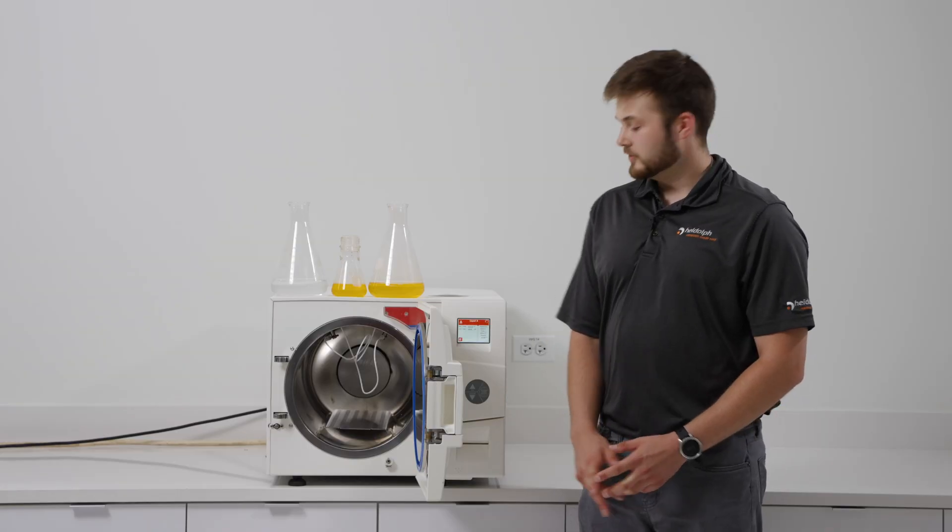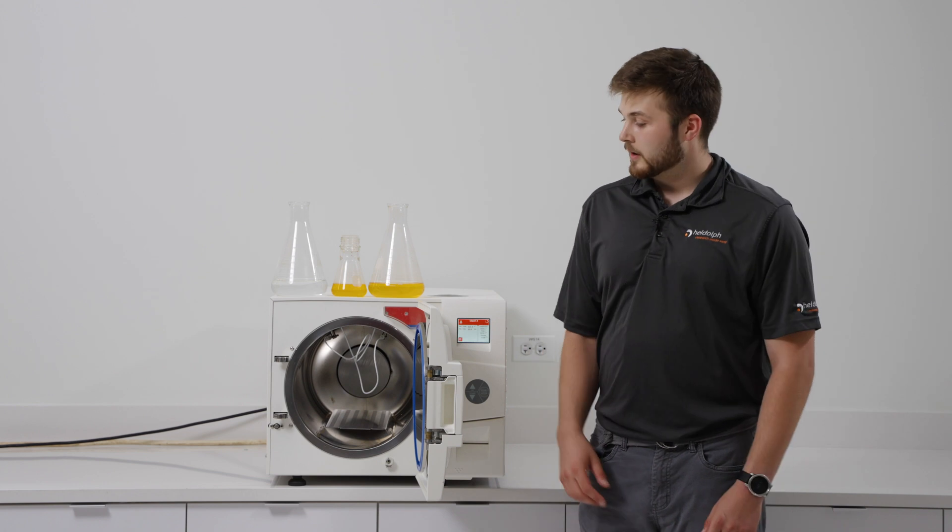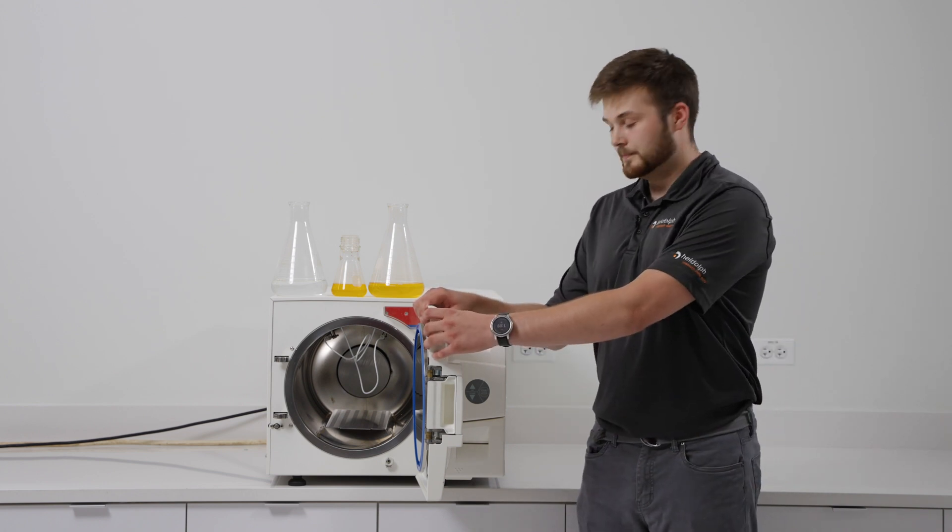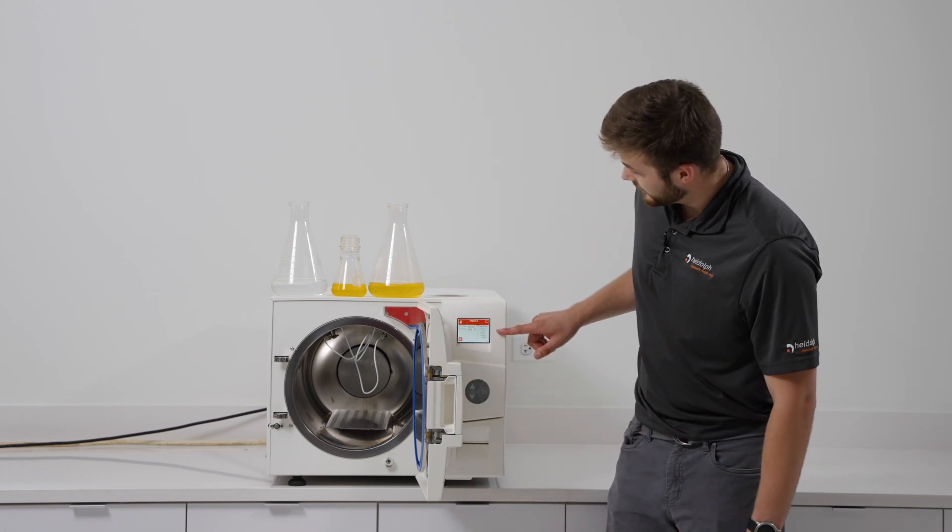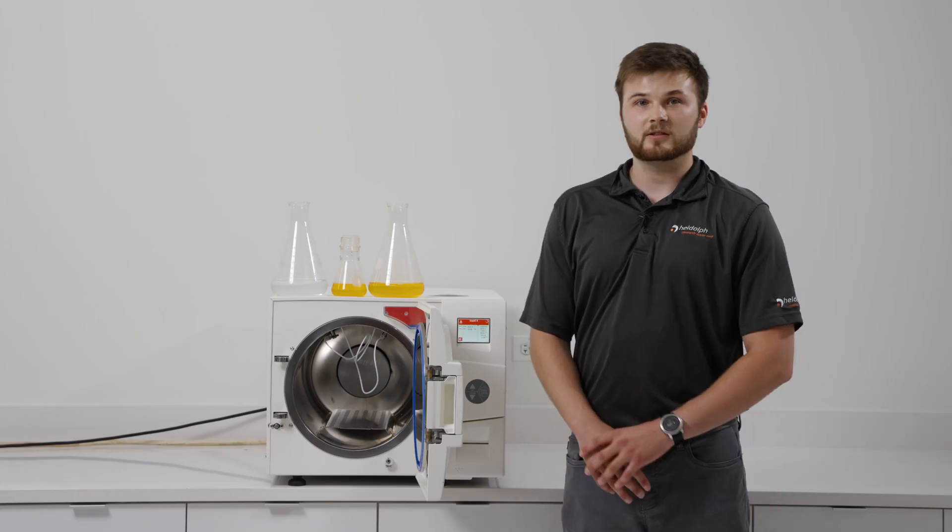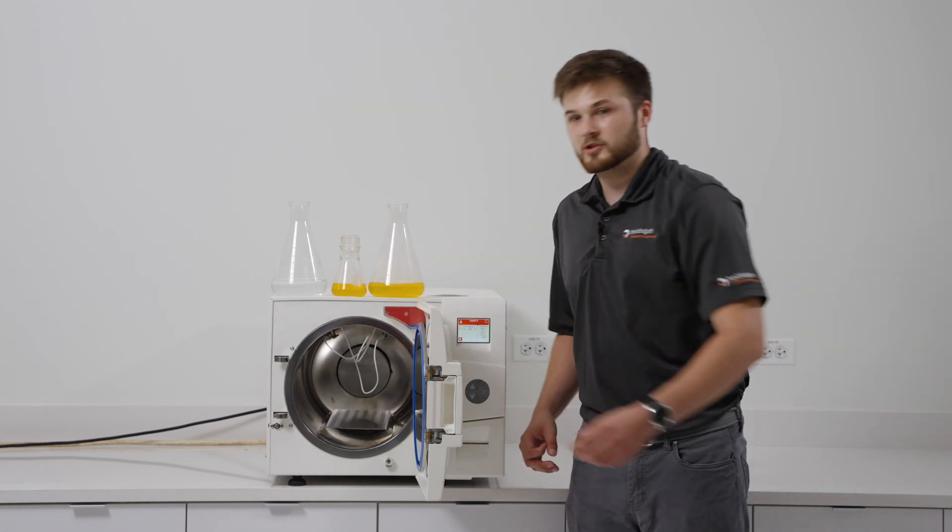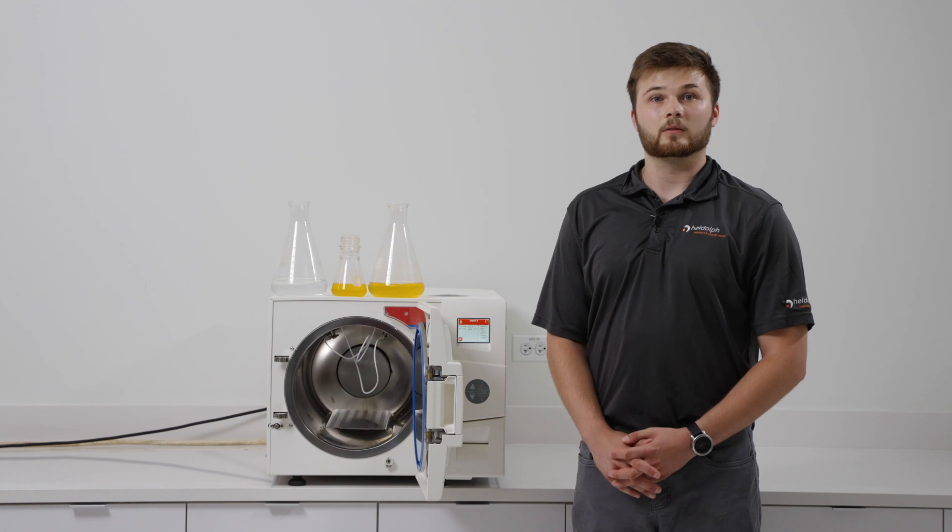Once you have the unit turned on, you can use the up and down arrow keys to select the appropriate cycle. You can only do this with the door open. I have the liquid A cycle selected here and you can see two different temperatures on the screen as well as a pressure. The temperatures displayed are the temperatures of the probes themselves and the pressure is the pressure being read within the chamber.